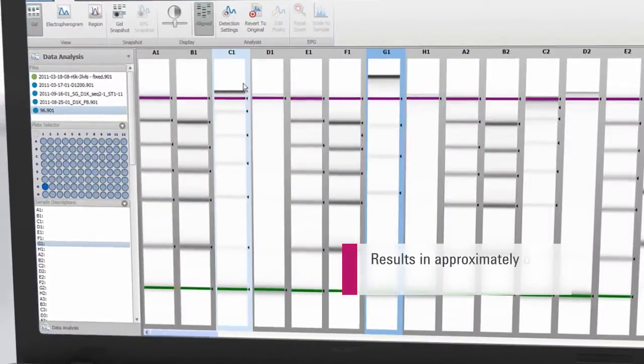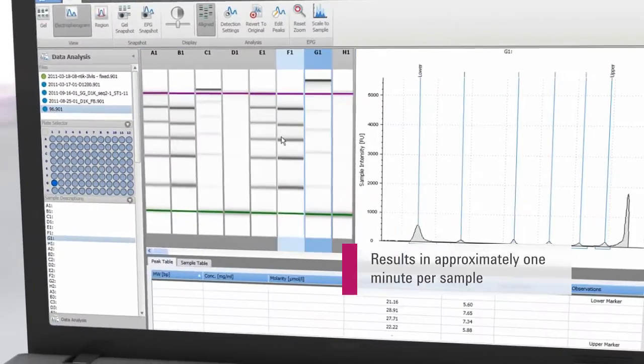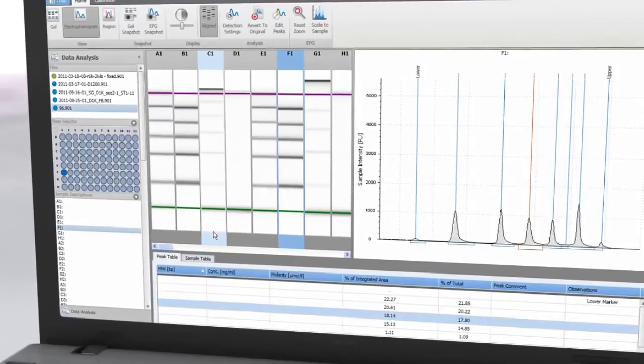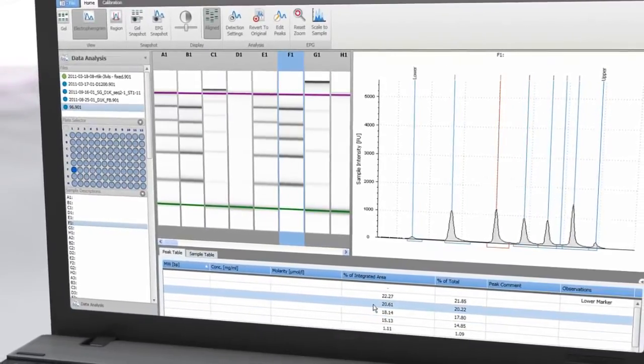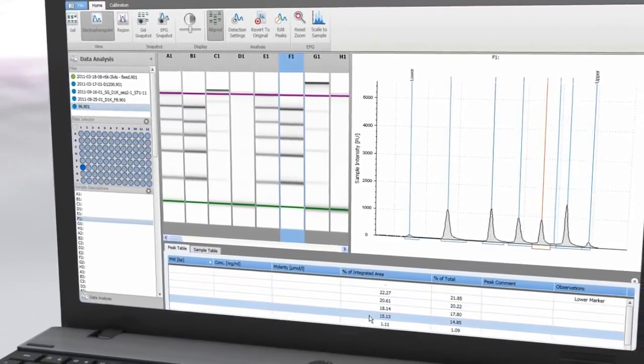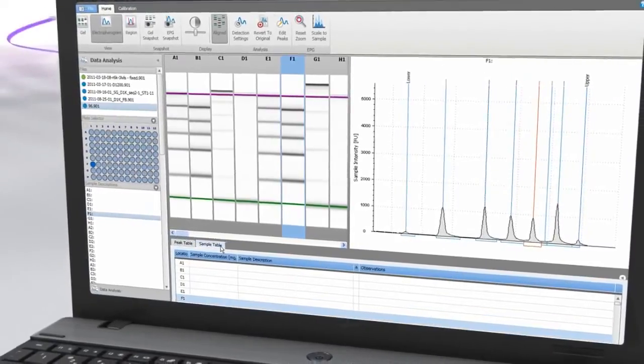Results are available in approximately 1 minute per sample and can be displayed as electropherograms, as gel images or in tabular format for effortless sample comparison.